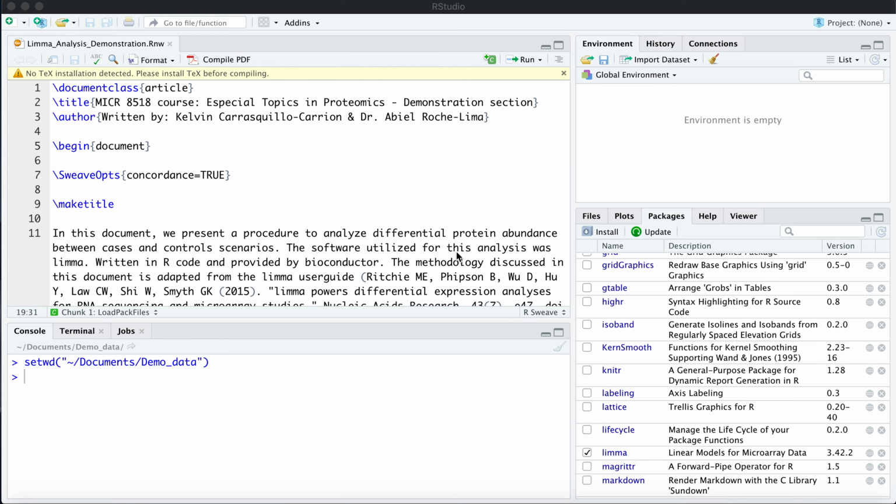So this, as you can see, is more nuanced code than what we were shown in the previous course. This is what we want to create if we have a package in Bioconductor, or if we want to give a book or a manual or documentation or a hands-on for practice or for learning. So this will be the format for your hands-on sessions as well.